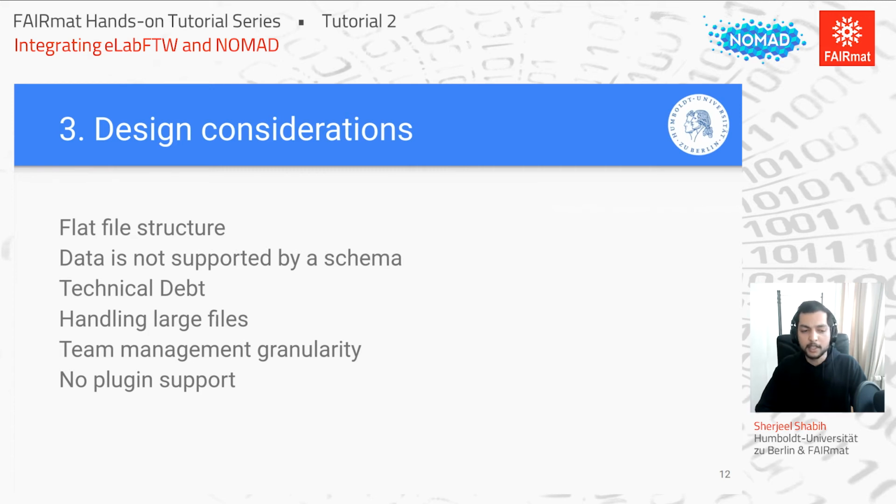And then, as I mentioned before, handling large files. Even though the upload mechanism was done, it was still a problem because let's say I'm in my container, in my launch tool, and I'm creating a file. It's not that easy to really place that file back into the same experiment structure. I'll have to write a script myself and really push that through the API instead of having access to the same kind of file structure that most apps would expect.